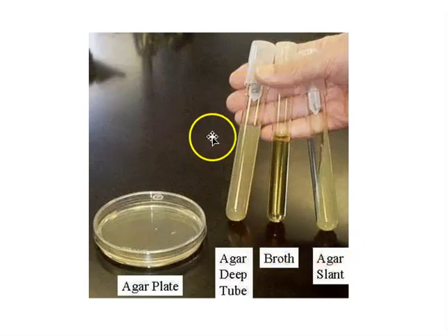In the middle, you can see agar that's been poured into a test tube. This is referred to as an agar deep. Now, you would not use an agar deep the way you use an agar plate. An agar plate has lots and lots of surface area for growing bacteria. But the agar in the tube has only a very small surface area at the top. Instead, we use an agar deep to grow organisms that have different relationships with oxygen. And we do that by using what's called an inoculating wire instead of an inoculating loop.